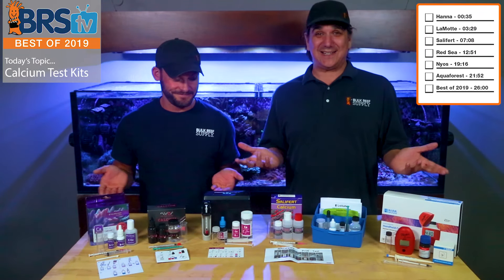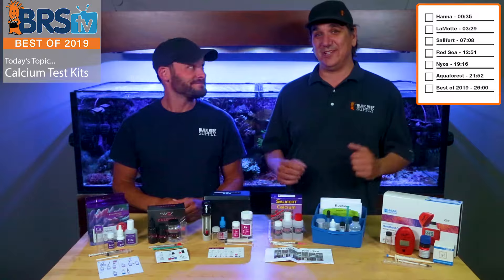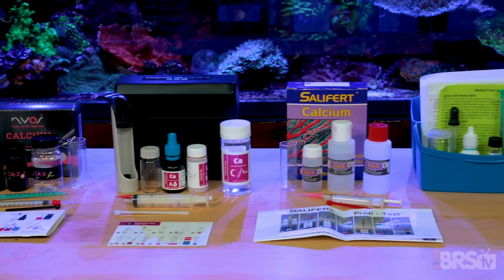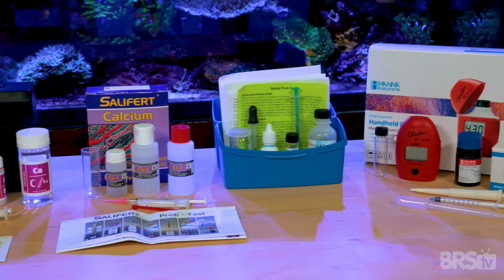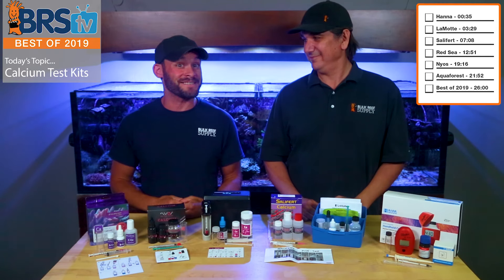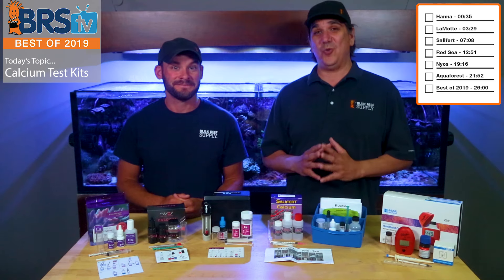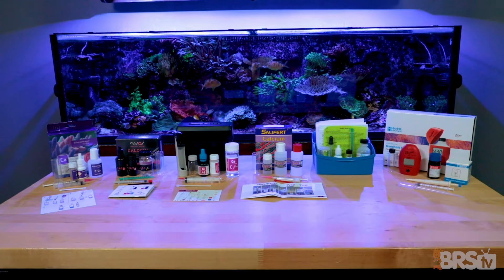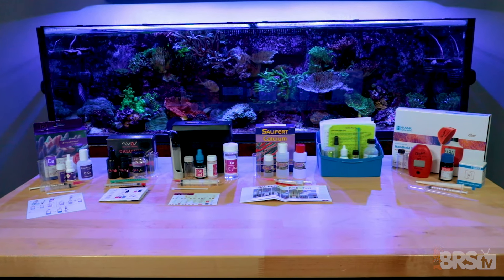Today on BRS TV, it's the best calcium test kit of 2019, and I think you're gonna be surprised at what you see. We've got six calcium test kits here. You don't always get to open each one up before you buy them, so we're gonna share what we like, what we didn't like, and at the very end give our thumbs up to the best of 2019. I can tell you right now, I learned something from this, so I'm almost certain that at the end you're gonna know exactly which test kit best fits your desires and be really confident about it.